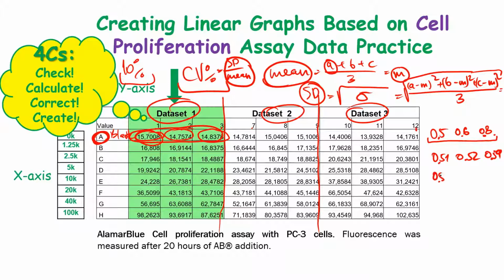So let's say this is our set 1, set 2, and set 3. Okay, so here you have 61 and 60. Of course, when you look at other triplicates, you would find that this guy is actually looking like an outlier. And you're going to perform some kind of calculations that will tell you that this is actually an outlier. So you want to exclude outliers.